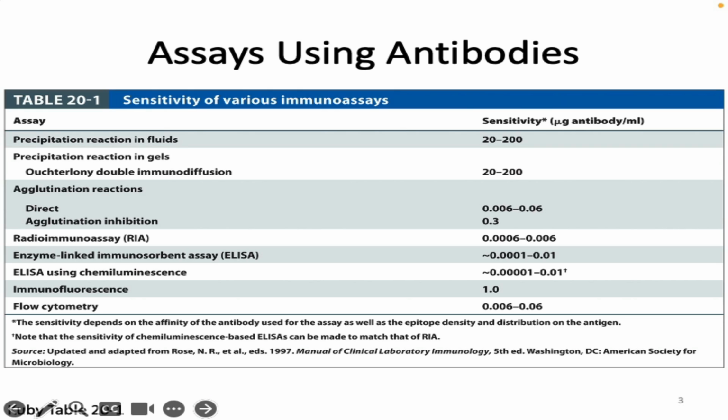I have a tube. It's full of a bunch of different proteins shown here as different little shapes. I can run that protein sample on a gel, and I'm going to get a ton of proteins of all different sizes. And then if I want to find my protein of interest, I can take an antibody, bind it to all these proteins, and detect where the antibody was bound. I'm specifically looking at this tail region to do my detection.